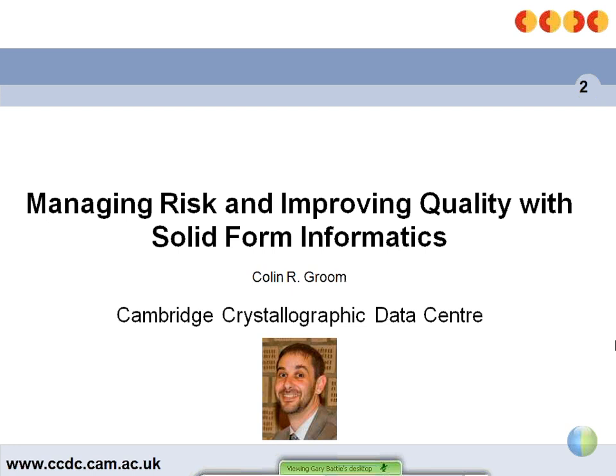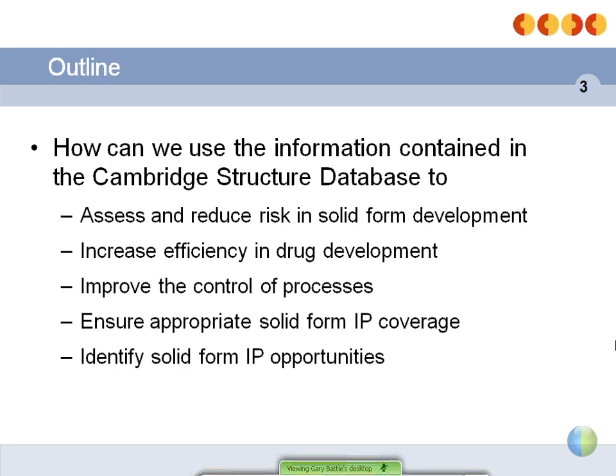Thank you, Gary, and welcome to the first webinar in this series. Now, I intend to introduce the research that's been performed at the CCDC over several years in the area of solid form informatics. This will then lead on to an introduction of some of the tools which have been developed and made available through the solid form module of the program Mercury. More specifically, I'll discuss how we can extract knowledge from the vast amount of data in the Cambridge Structural Database and apply that knowledge to allow material scientists to make better decisions during the development of new compounds.